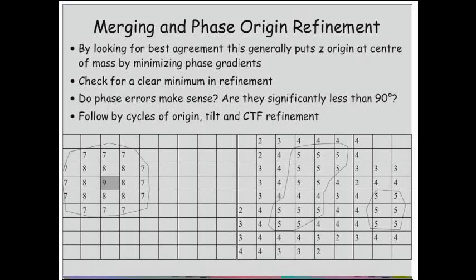So this would be, for example, the phase shifts along X and along Y, and you get a scoring matrix based on the phase residual at different phase shifts in X and Y. If you get a nice peak like this with a high score, this is a very clear and unambiguous score and a quite clear phase origin for the film that's being compared against the others.